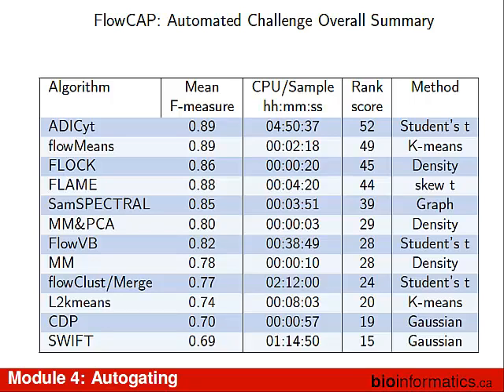Another problem that I have with that as the gold standard is because I think we could do better. I think, because that's where I'm coming from, and I'm letting you know my biases, I think computers can do a better job of finding these cell populations in high-dimensional space than humans can. That's my hypothesis. I can't prove that.